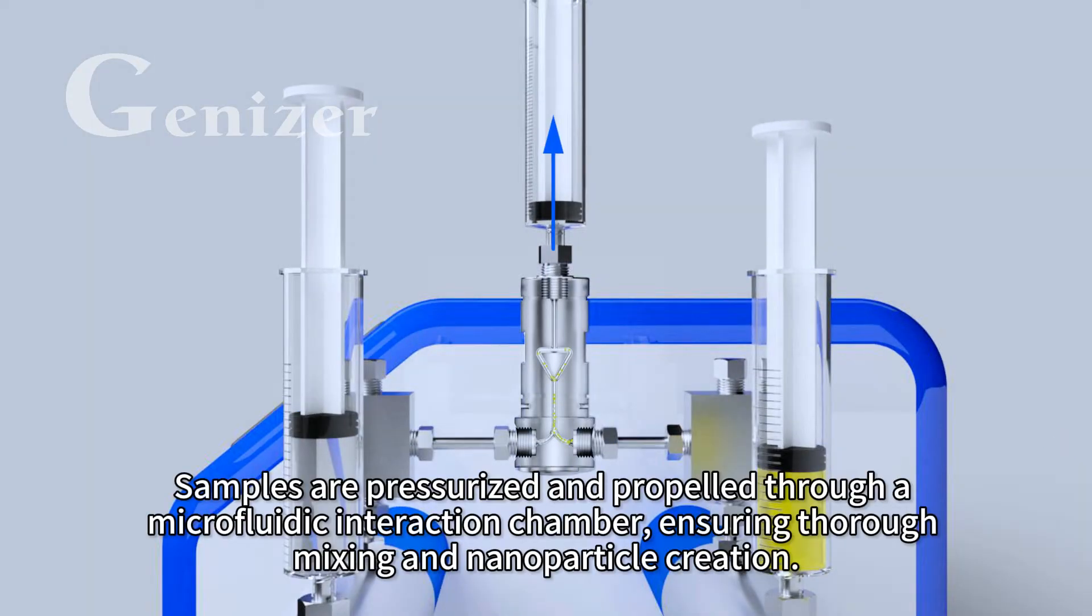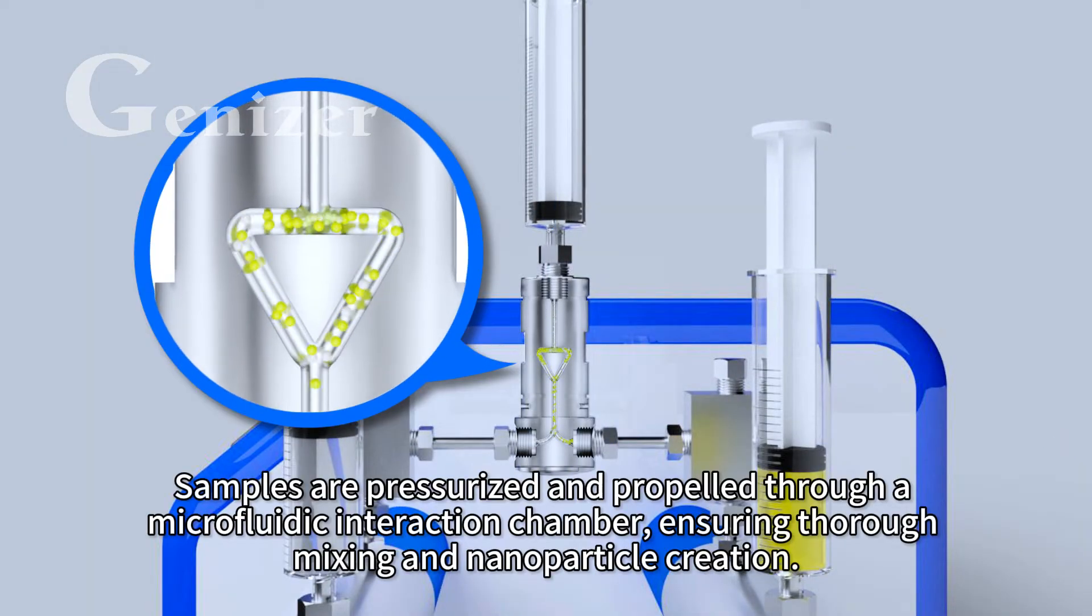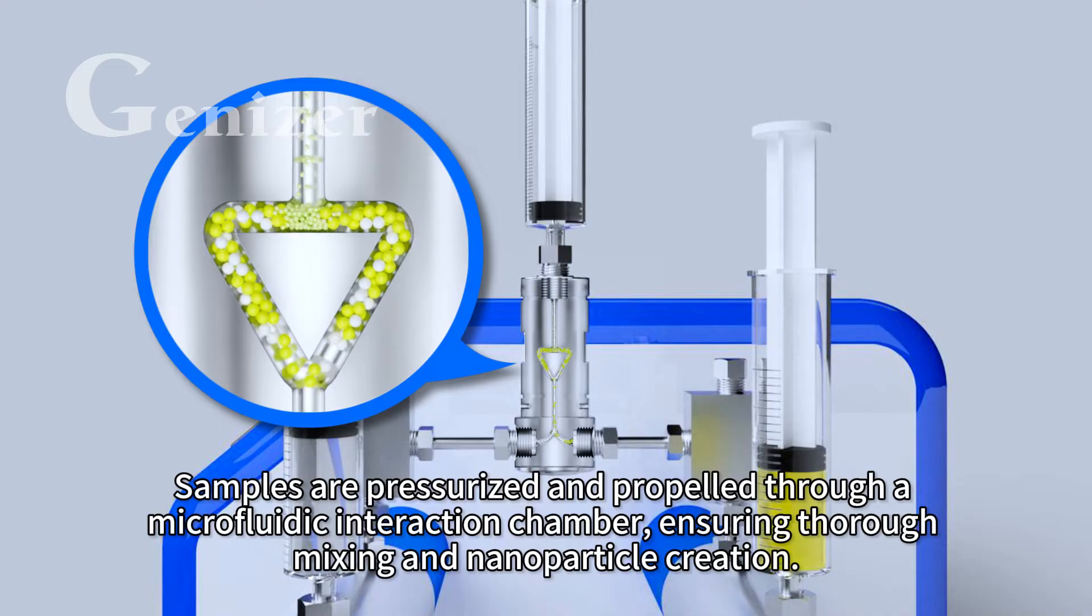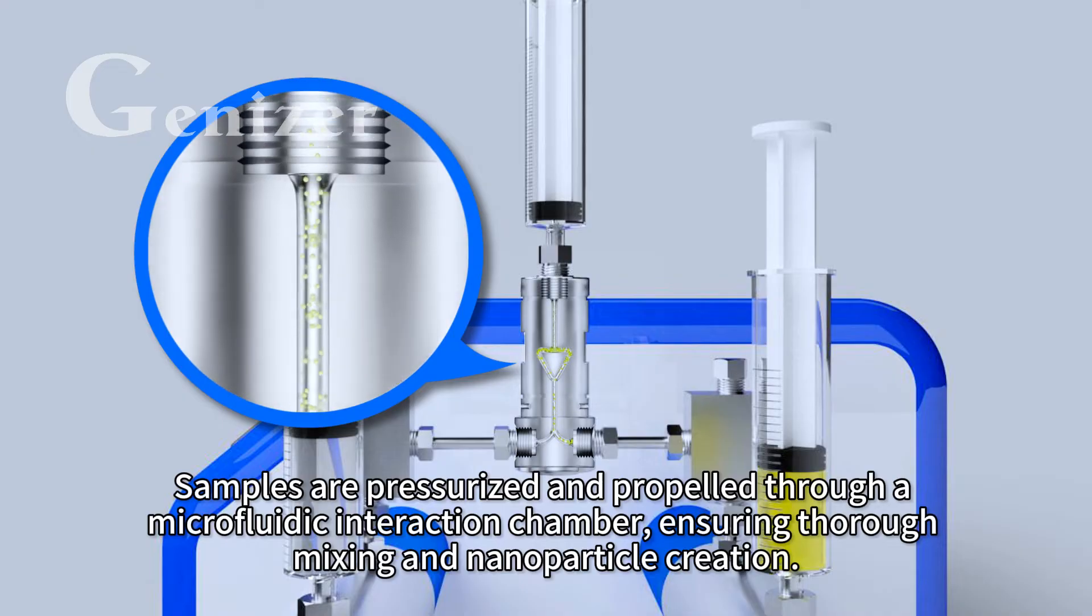Samples are pressurized and propelled through a microfluidic interaction chamber, ensuring thorough mixing and nanoparticle creation.